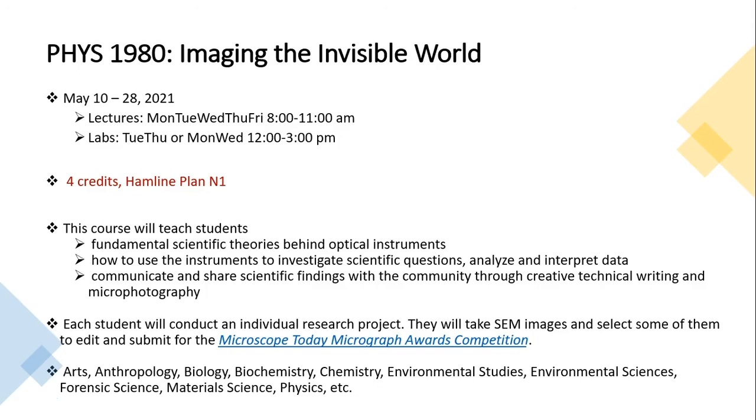And each student will conduct an individual research project. They will take SEM images and select some of them to edit and submit for the Microscope Today Micrograph Awards competition. So through this course, the students will learn how to utilize the SEM at Hamline for research projects, education, and community service.